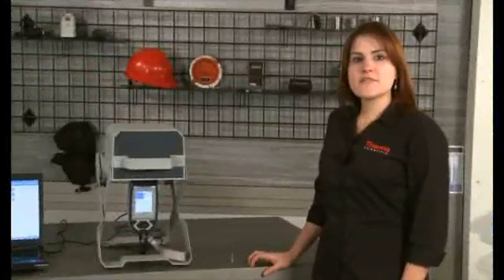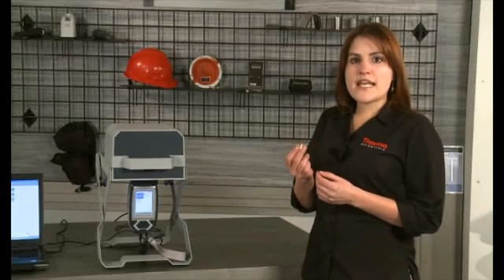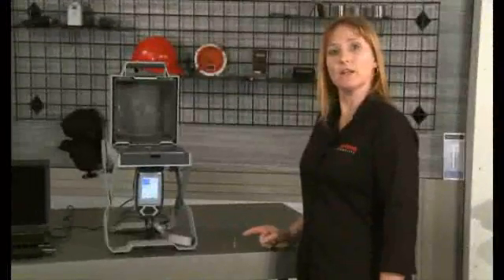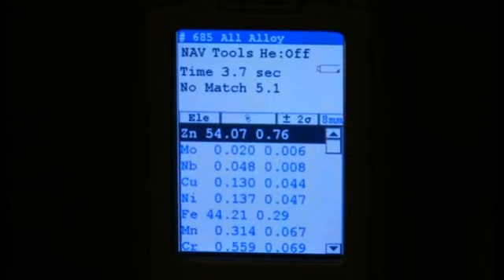As we said previously, the instrument operator must be alert and able to make good judgments in cases where the sample is not clearly representative at the measurement surface, or it cannot be fully analyzed for all alloying elements. Some surface coatings are not obvious because they are similar in color to the alloy. Examples are silver or cadmium metal coatings that might look like the alloy itself. Some examples of the need for a judgment call on the part of the operator will be given next. Here is a sample of a bolt that when measured initially reads a mixture of steel and zinc.